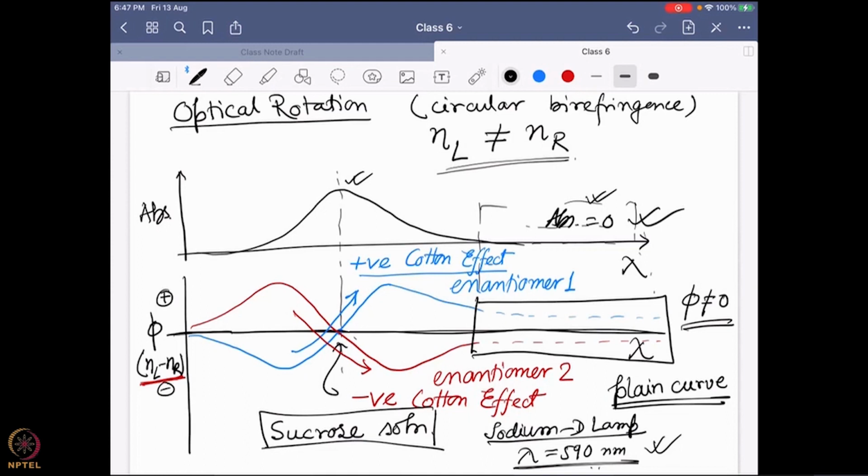And this full system, where we are measuring an optical rotation value with respect to changing the lambda value, or the wavelength value, is known as optical rotatory dispersion, or ORD. So now if I say draw the ORD data or look into the ORD data, now you know exactly what you are looking into: the optical rotation value changing with respect to the change of the wavelength.